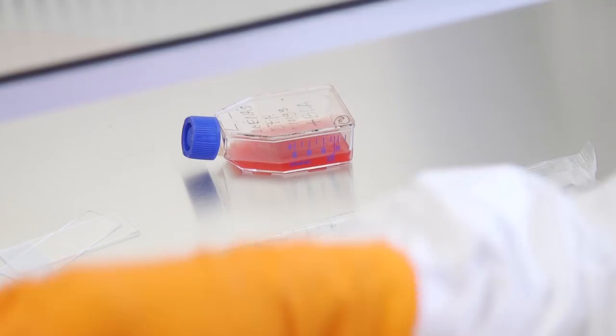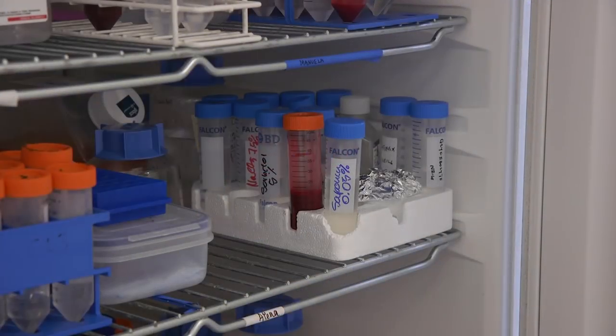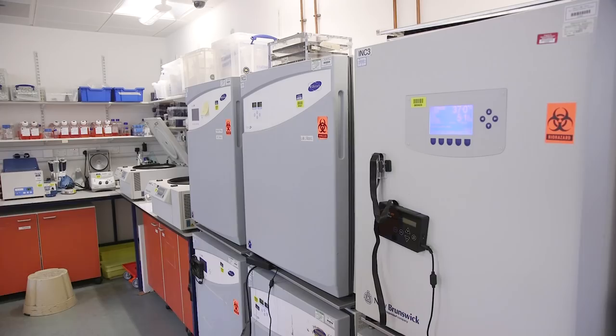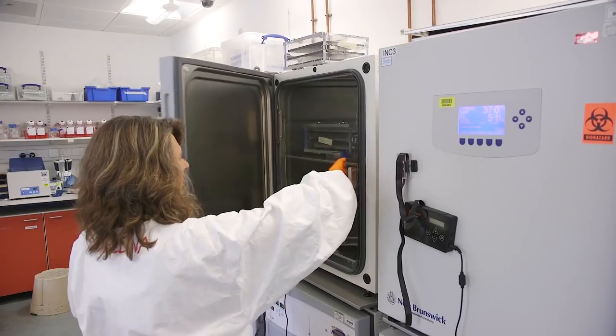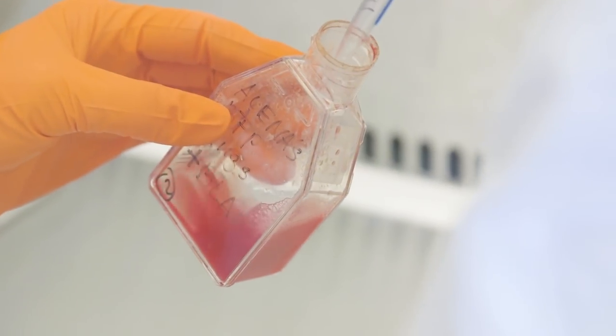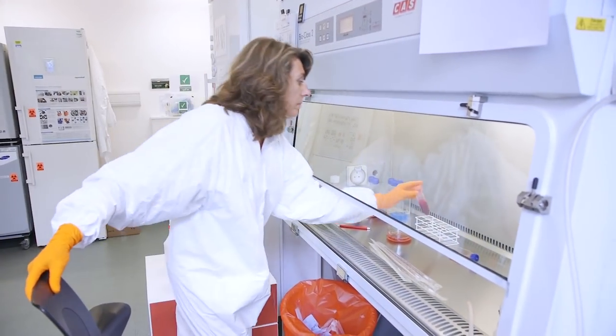We culture the parasite in plastic flasks and petri dishes using blood from the NHS blood and transfusion centre. Malaria parasites need special conditions to grow in the lab: a specific mix of gas, a 37 degree environment to mimic body temperature, and a fresh supply of blood.